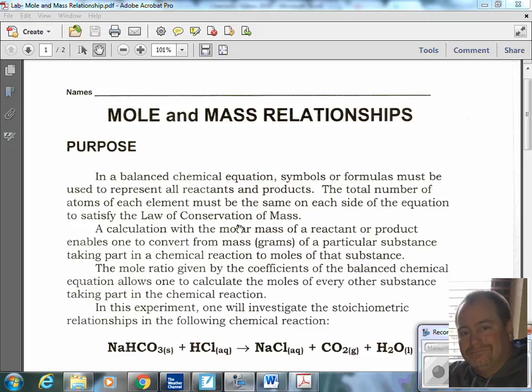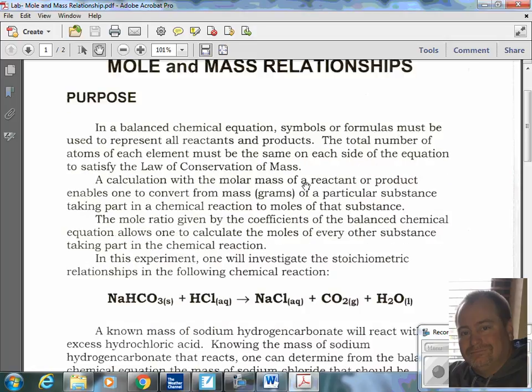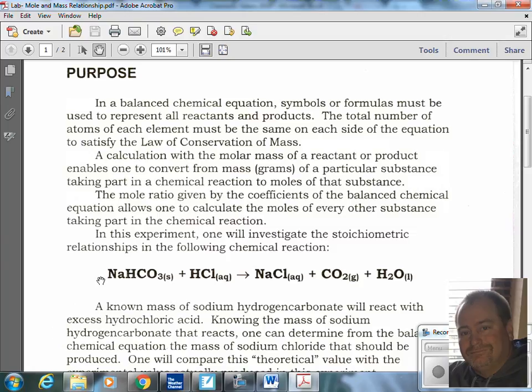Mr. Braun here. Today, I'm going to go over the pre-lab video for mole and mass relationships. Now, the purpose of this lab is we are going to investigate the stoichiometric relationships of the following chemical equation right here. Okay? So we're going to take this equation and get some stoichiometric relationships.